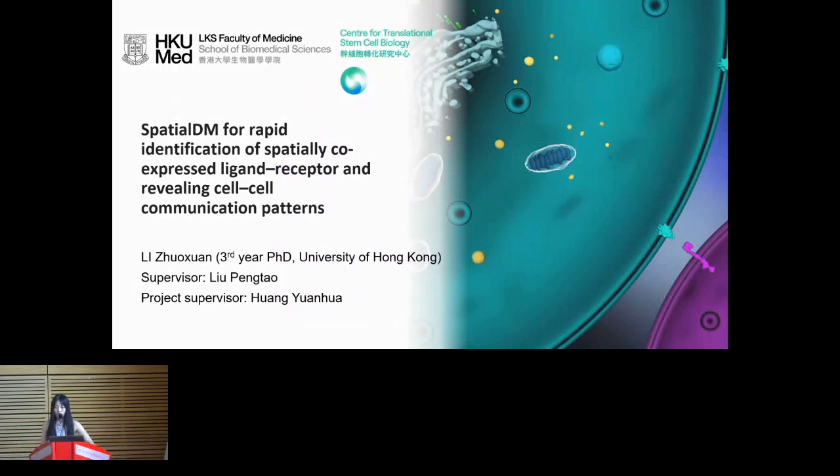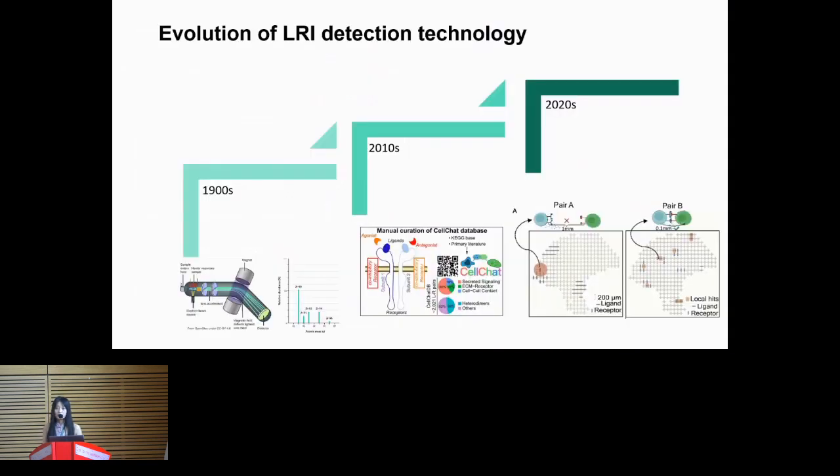Have you ever struggled to analyze ligand-receptor interactions in your spatial transcriptome data? If so, a powerful tool I'm going to show you today called SpatialDM may help you overcome this challenge. Techniques to study ligand-receptor interactions have been evolving.